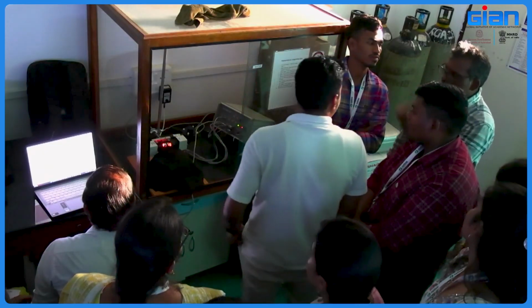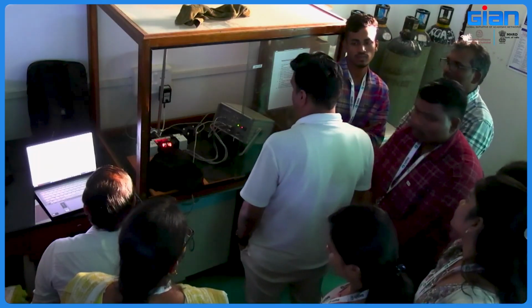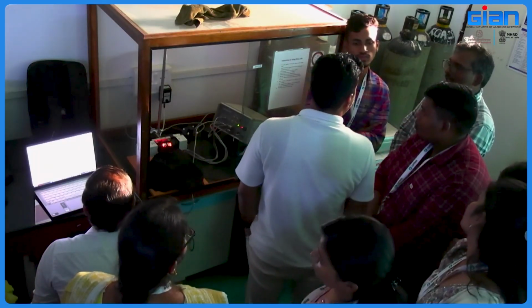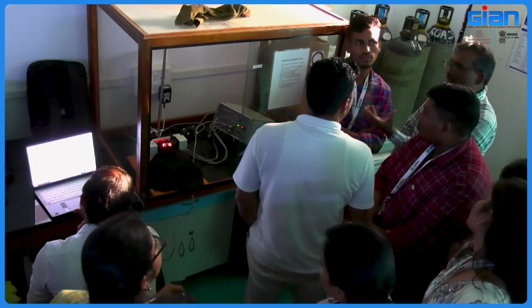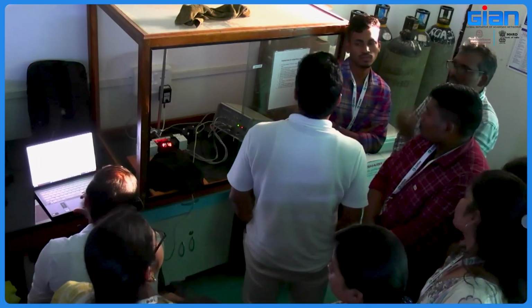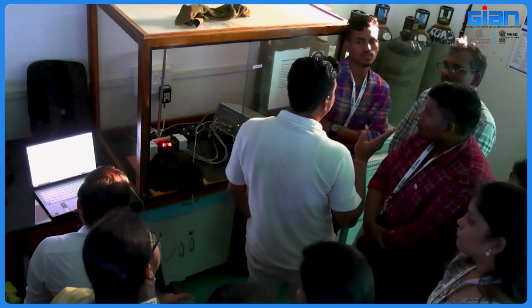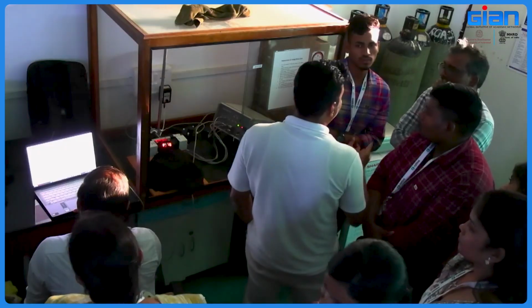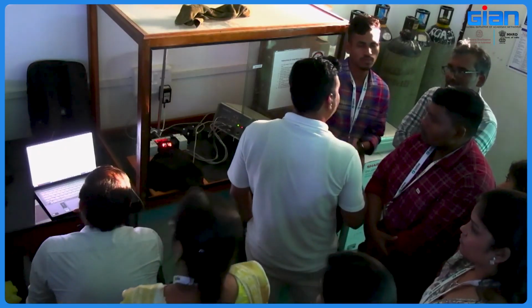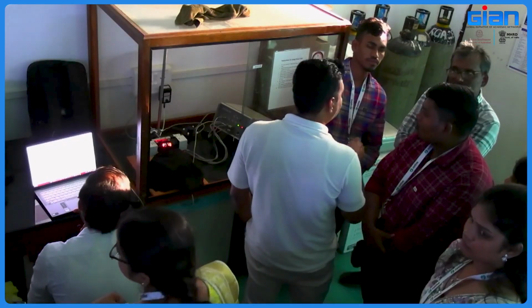I'm very confused. Actually, what exactly do we need for our experimental purpose? Suppose you want to see PS1, PS2, basic things you can get from HandyPEA. Fv/Fm, that is the primary step. If you want to check whether a plant is under stress or not, that is the primary step. You just check Fv/Fm, that's it. You get to know that it is having stress.